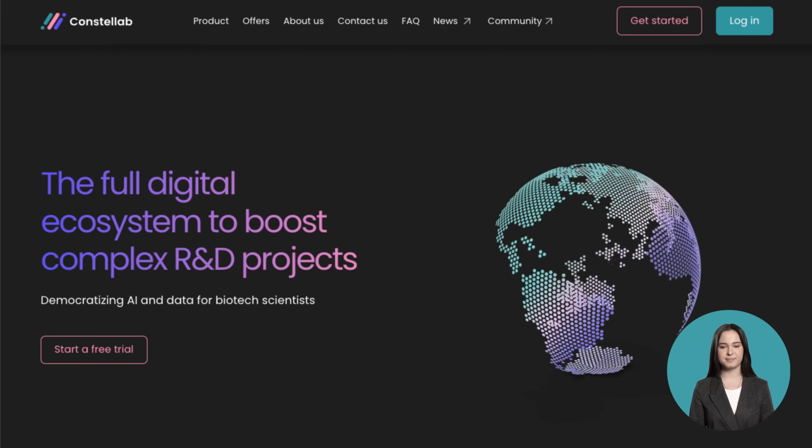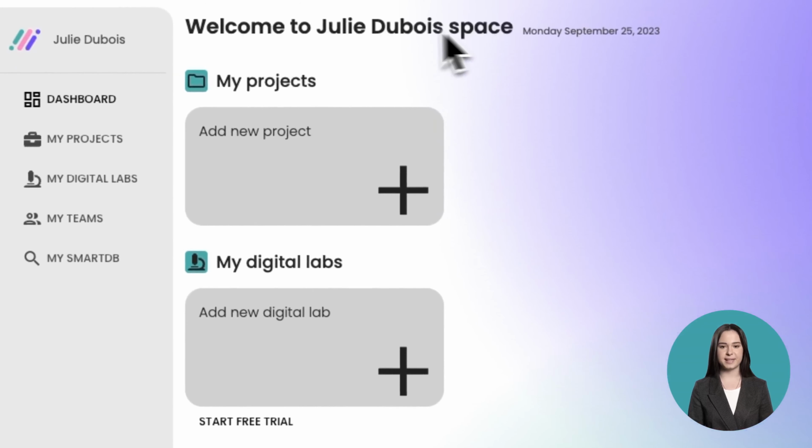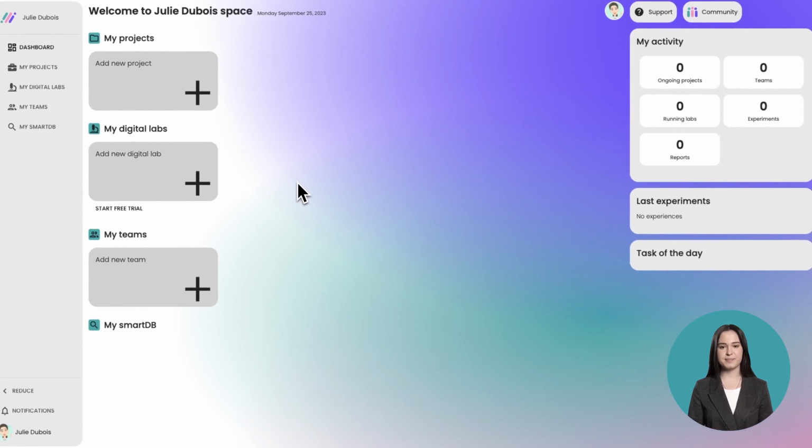an expert. I'm connected to Constellab using a demonstration account with Julie, and if you log in for the first time, you should have a similar dashboard.